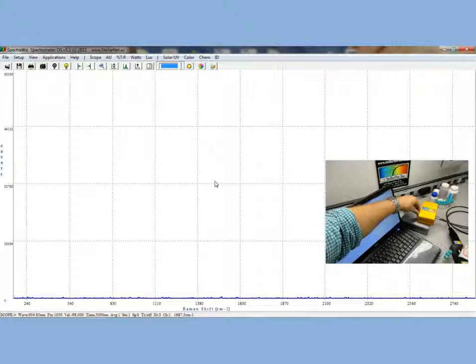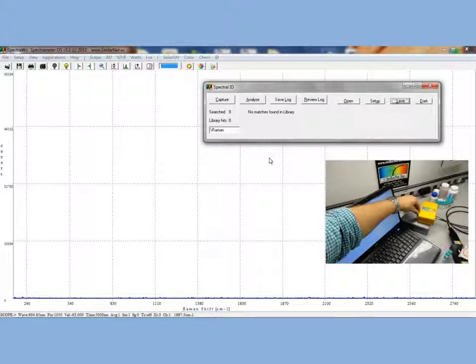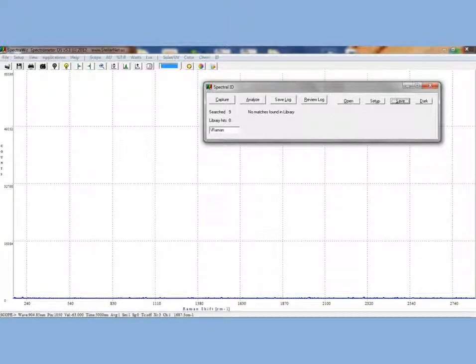Now let's go ahead and activate the laser by turning the key switch on the back of the Raman laser. Now click on the ID tab to launch the SpectralID Raman search tool panel.